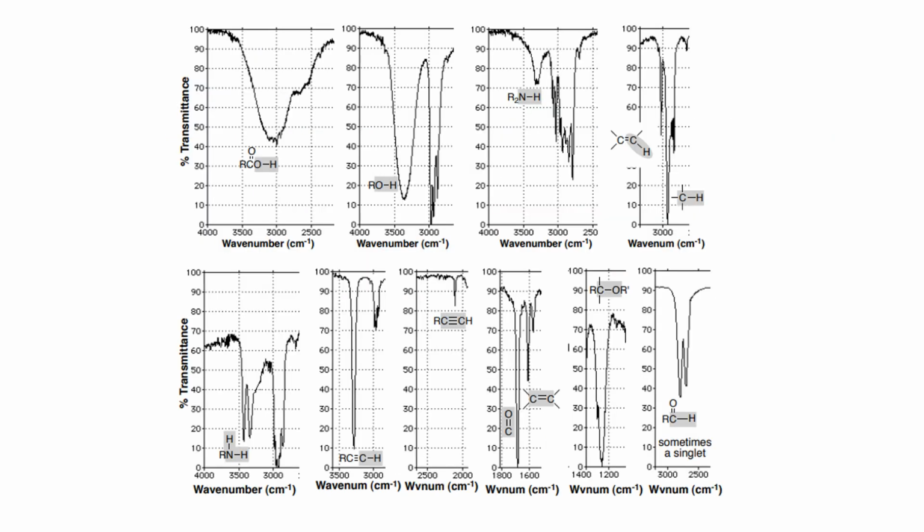That's what we're doing. And these are important shapes that you need to remember. You're going to have charts, but still you need to know shapes. Notice that this is highlighting hydrogens. So the hydrogen in a carboxylic acid is a very wide band. And notice that it's centered about this line, about 3200 or so, or 3000. But it is wide, and sometimes that covers other bands.